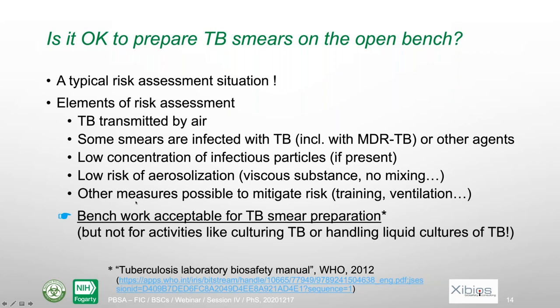Also, we can have other measures to mitigate the risk. Of course, people who do that should be trained. Ventilation can help, and also in some cases, personal protective equipment. So clearly, because it's a low risk activity with respect to aerosol, bench work is acceptable for the preparation of TB smears. This is the conclusion of a risk assessment study done by WHO.